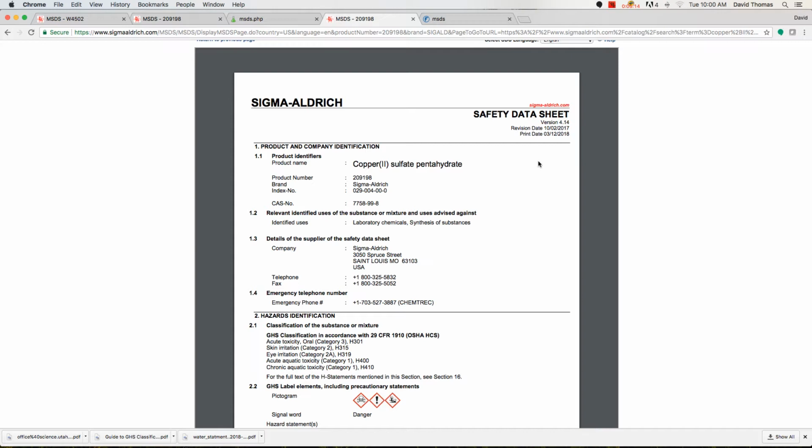Now, while the information will largely be the same for the SDSs, it's important to recognize that it will not necessarily be identical. There can be variations in the SDS forms from different suppliers, and sometimes one form can say one thing and the other form can say something completely different, or they can be almost opposite in how they treat a particular subsection or piece of information.